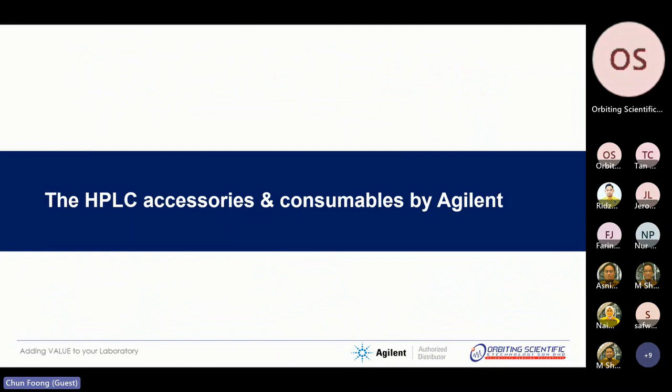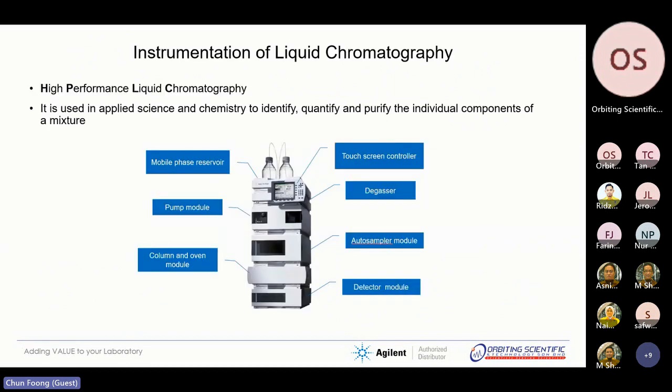So today I would like to share those HPLC accessories and consumables by Agilent. Let's start with this, the instrumentation of the LC.